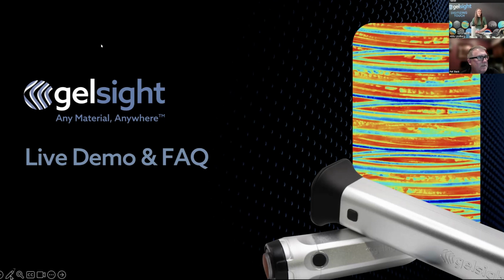Next question. Is there a calibration for every measurement if we change the location of the sensor and the surface type? No, you just need to calibrate each gel before it's used. And that doesn't mean every time I connect it to the probe. So let's say you have 10 gels, you could calibrate all of them and then drop them in as replacements when you need them. But the calibration is independent of material. It's really just one set of settings for every material.